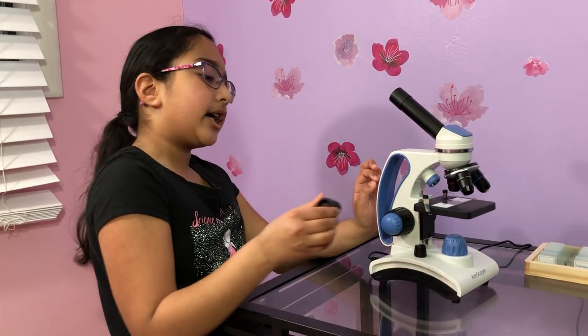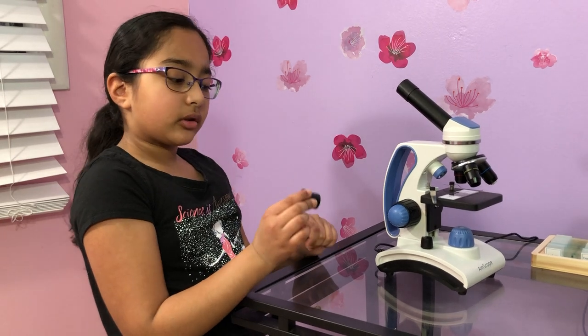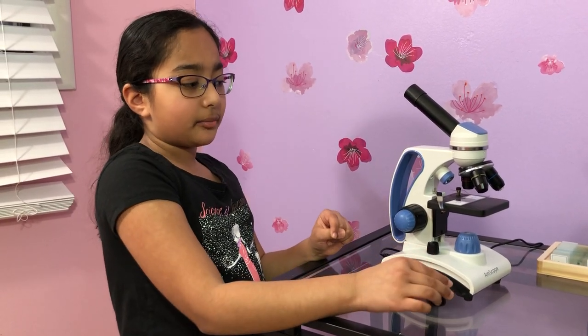If I have the 25x eyepiece and still use the 4x objective, it's going to be 25 times 4, which equals 100. So then it's going to be 100 magnification.